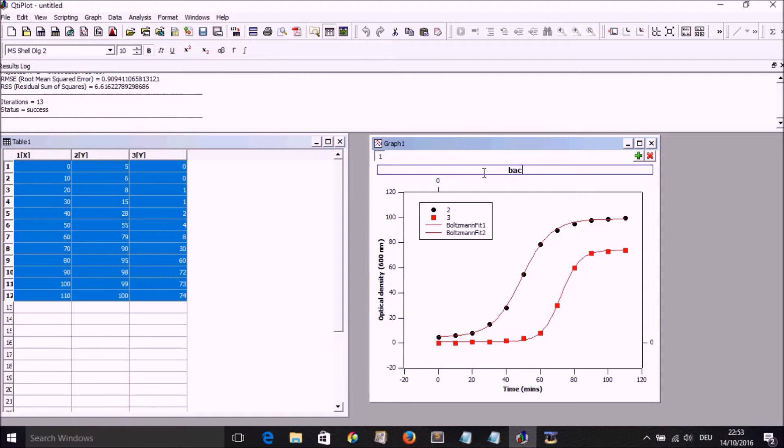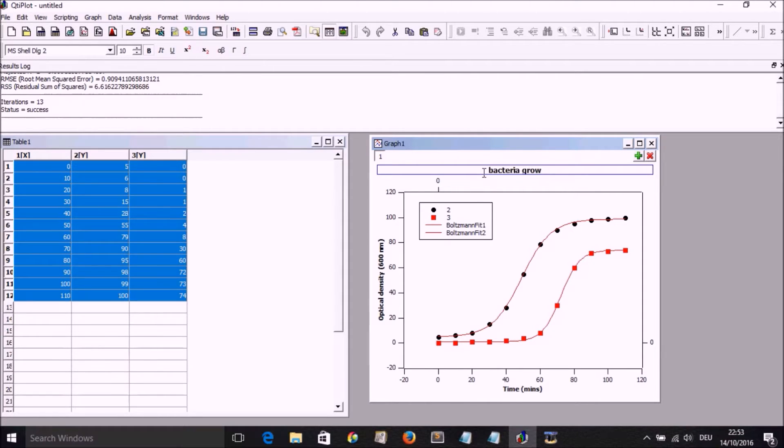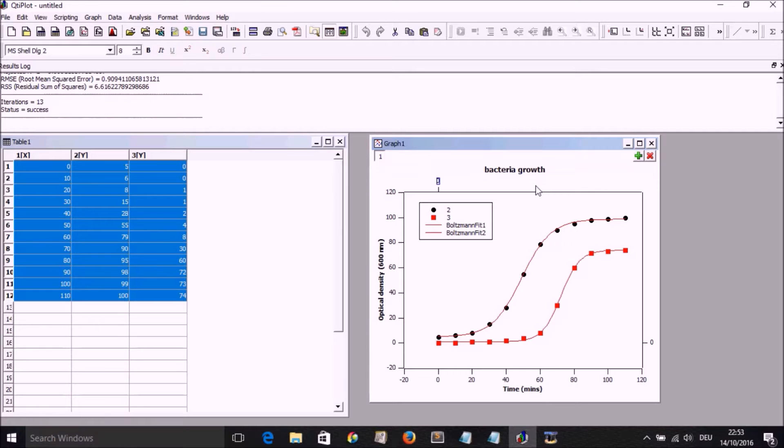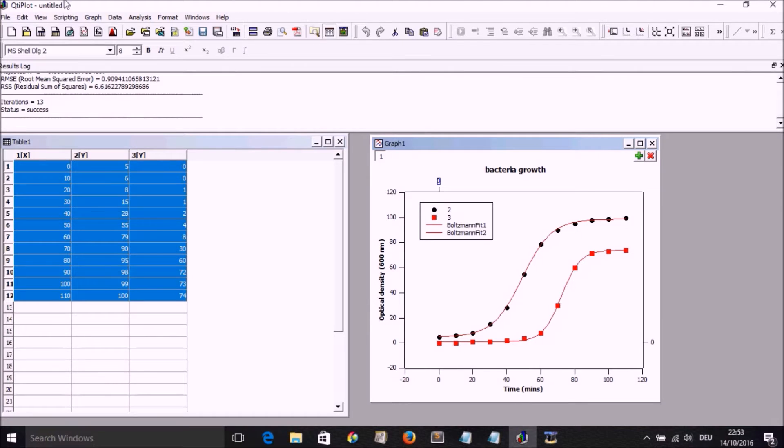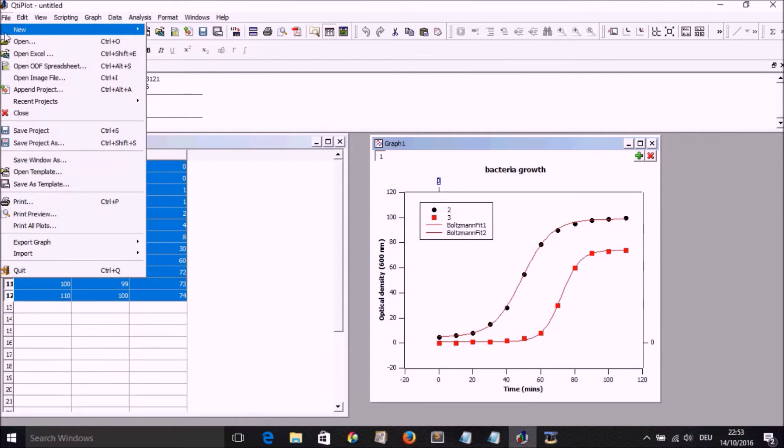Write whatever title we want to write there. Let's say bacteria growth or protein aggregation growth or whatever. And we now have all of those.